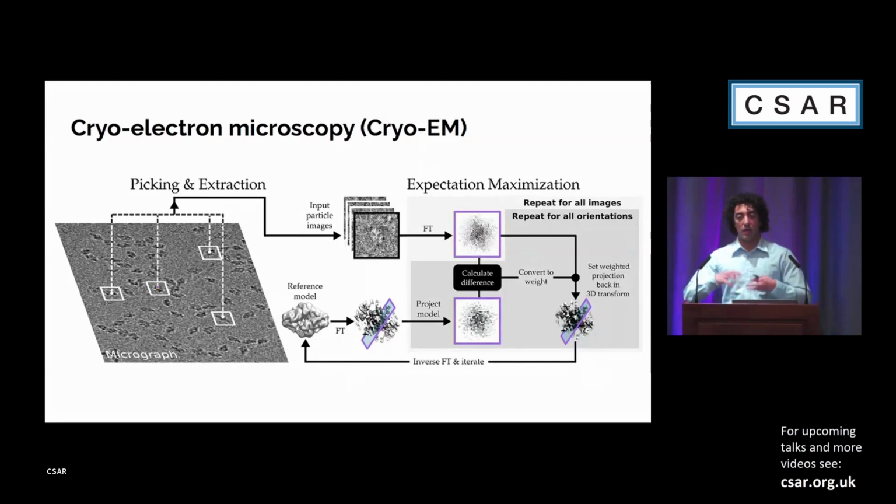And that includes getting the protein that you would like to solve the structure of. Usually, you express it in some bacterial system, you purify it, then you freeze it in very thin ice. And then once it's frozen, you basically shoot electrons at it in an electron microscope. The problem here is that you have a 3D protein. When you do this process, what you get out is basically 2D projections of your protein, and you then have to solve the 3D structure again using some algorithms.